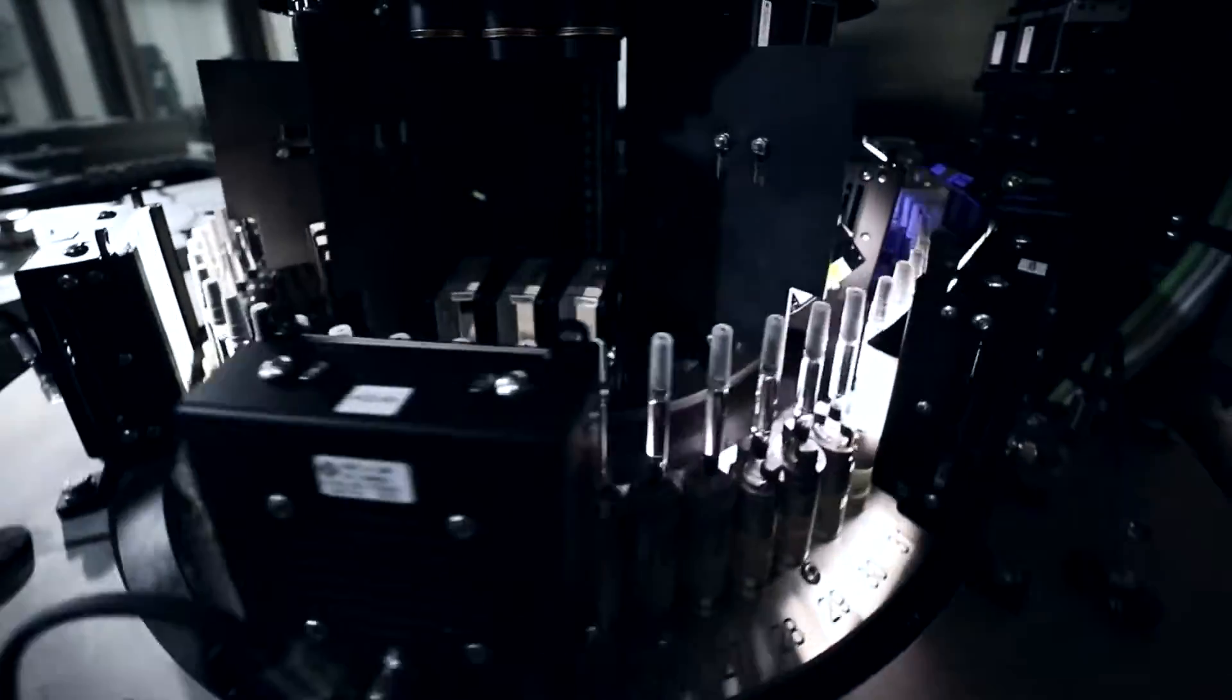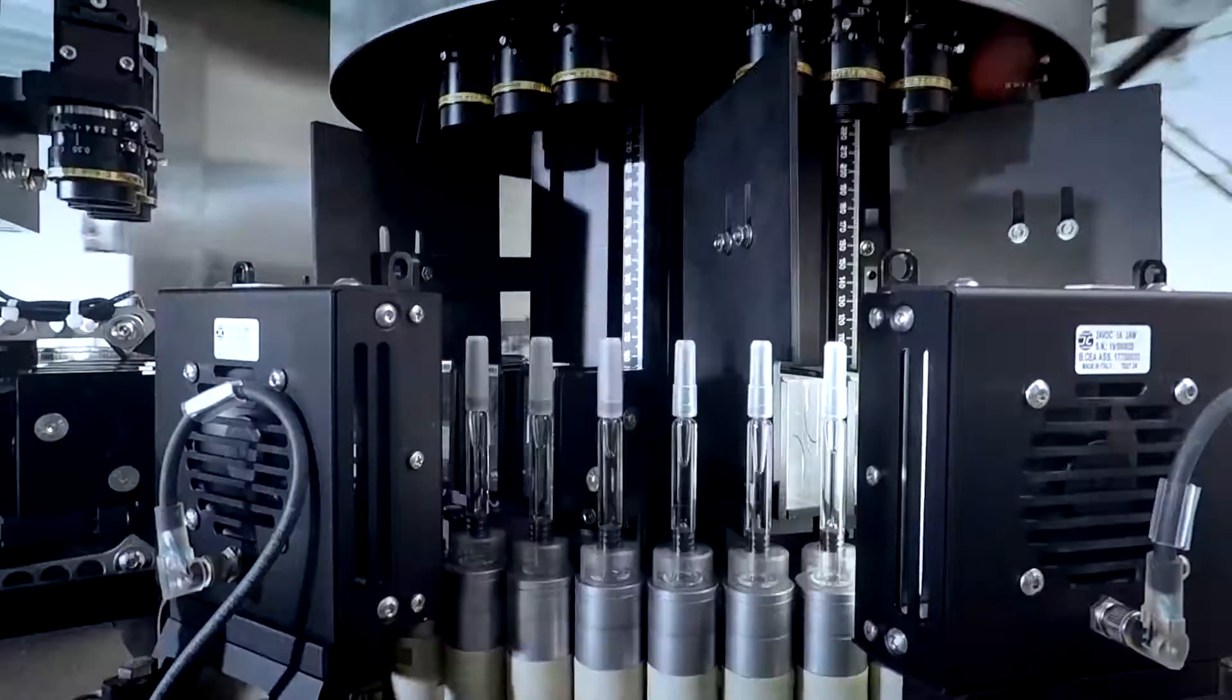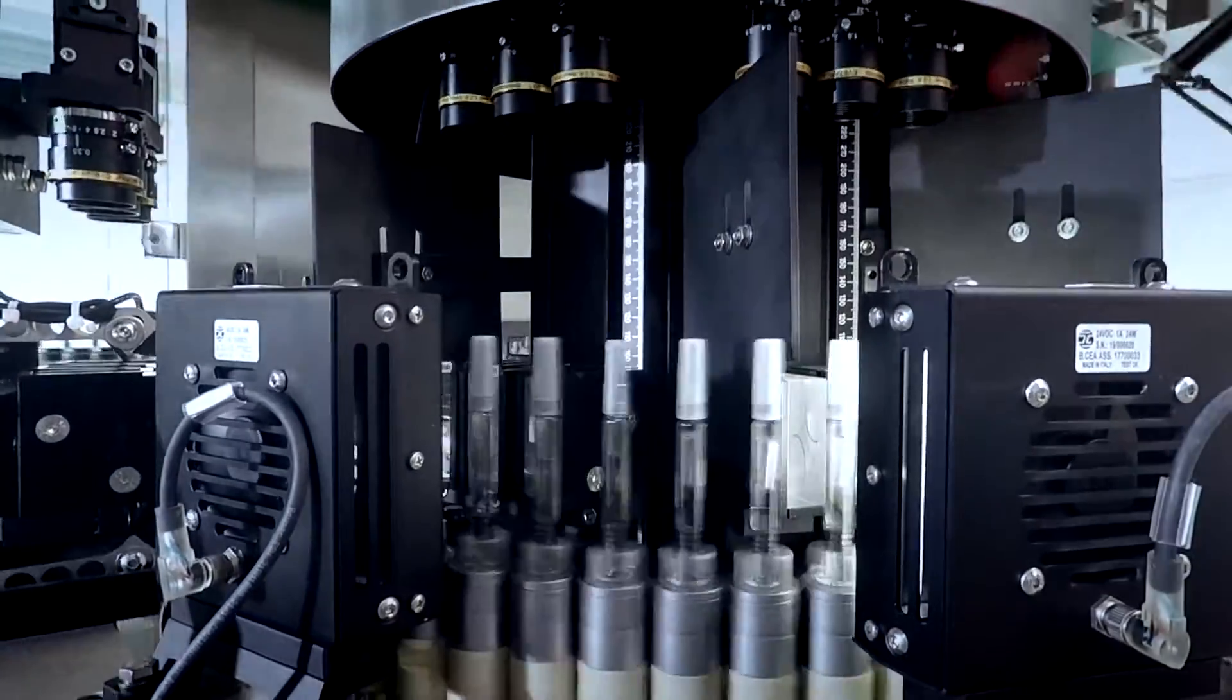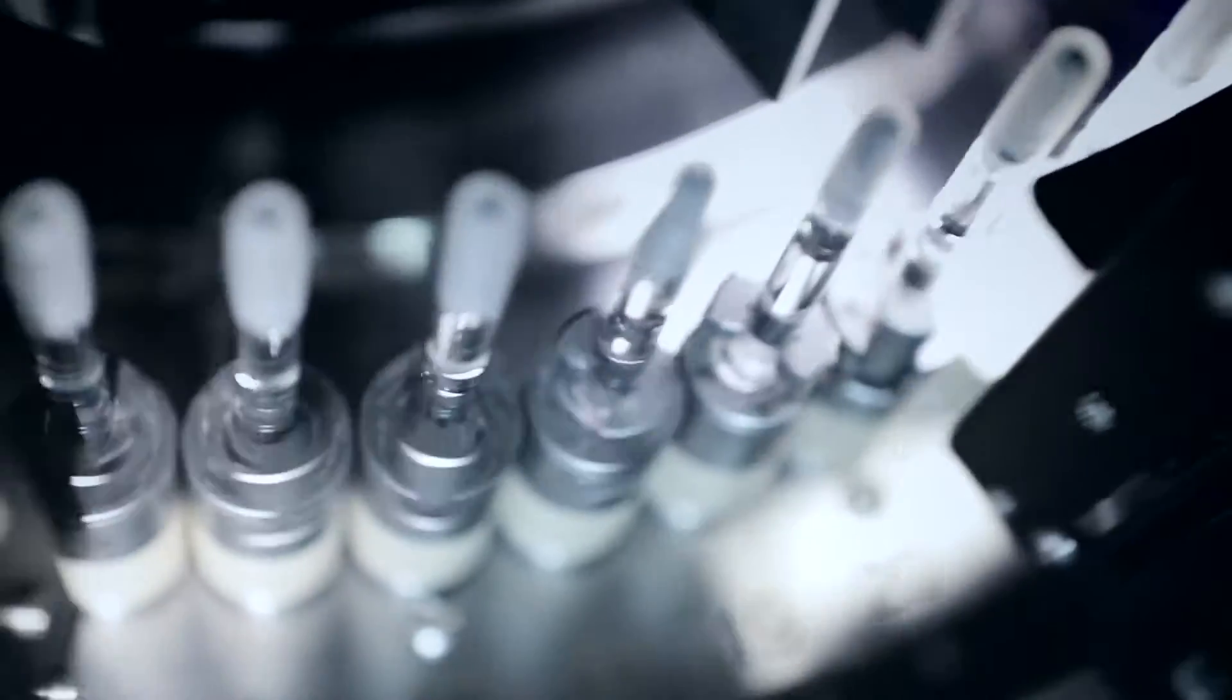Advanced mechanical design guarantees precise optical alignment between cameras, lights and containers for superior detection performance. Fast container rotation is performed by controlled servo motors, and can be independently adjusted according to each specific product.